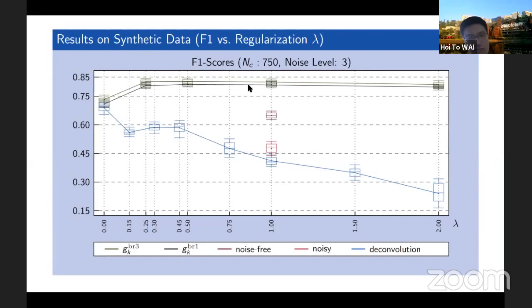And then how to discretize the Gaussian in space is given by the resolution of the camera, right? The cameras used now are 2000 pixels and cover one of these wells. In those, a single spot is around 50 to 100, 200 pixels. So the kernels are of that size, 50, 100, 200 pixels. So they're quite large, but the resolution of the sensor is more than you need, essentially, for the application. You could do something in the neighborhood of as well with a lower resolution sensor.